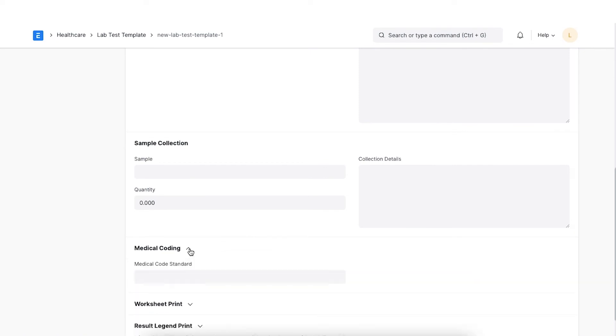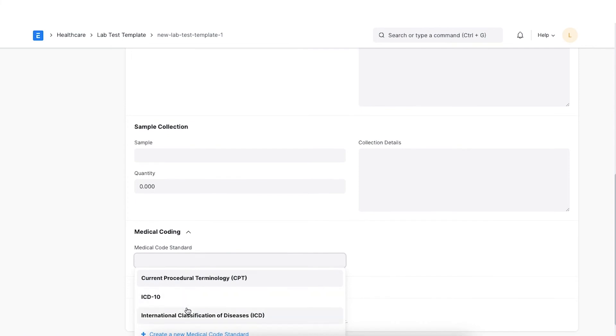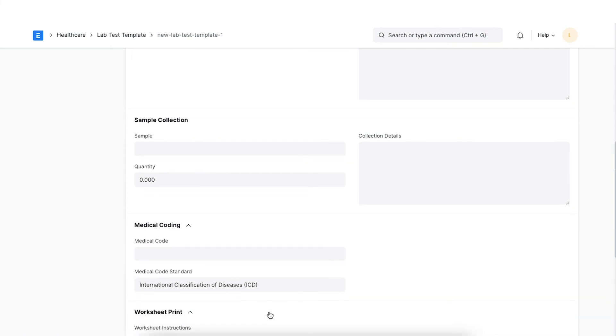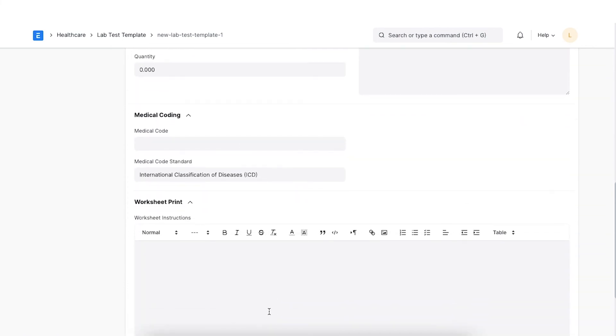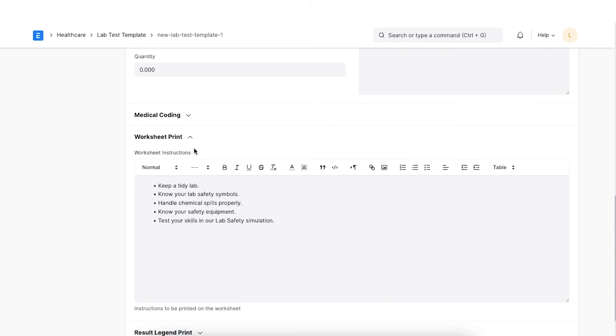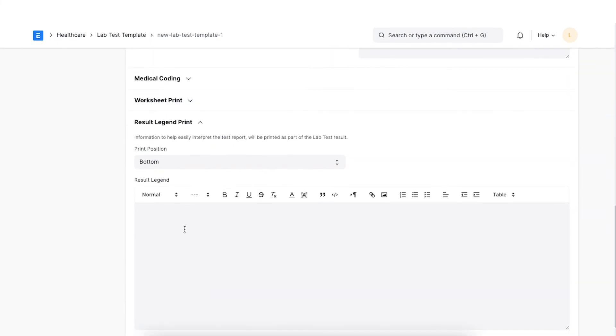We can also configure the Medical Code Standard and Medical Code for your templates in the Medical Coding section. Next, we can configure the instructions for lab technicians in the Worksheet Instructions section. Lastly, in order to help easily interpret the test report, we can add some information here. Select the position where you want to print this information and configure the legends in the Result Legend field.